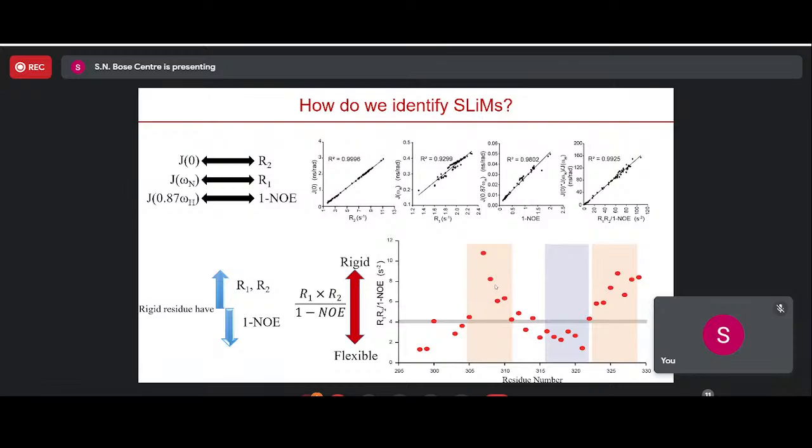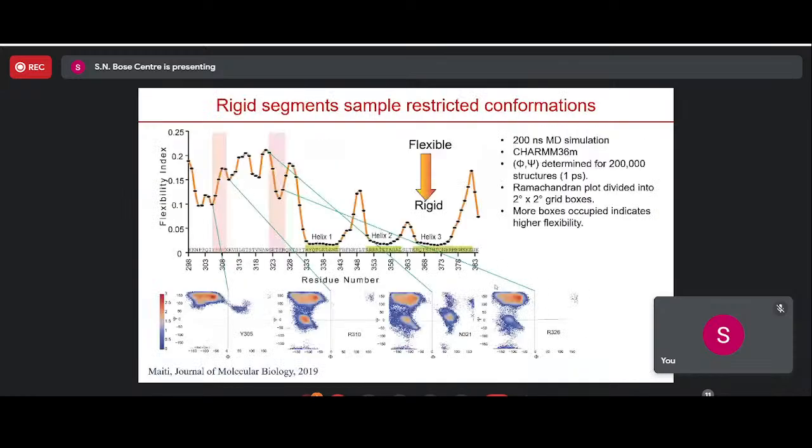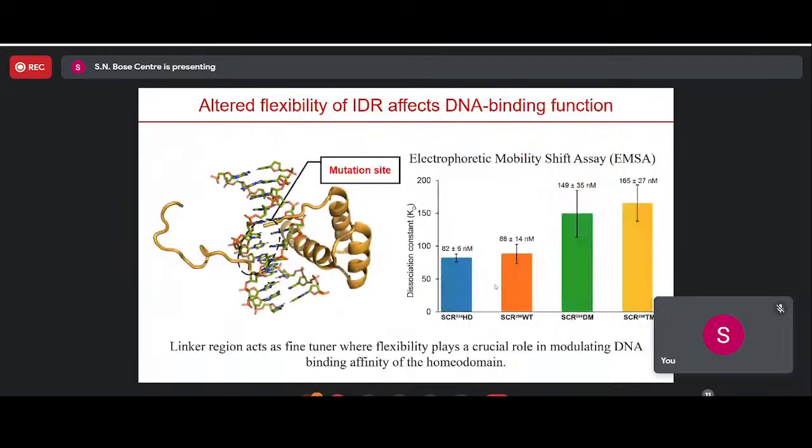Like some part of the protein is missing, the residues. Yes. So this is actually from a crystal structure, right? In a crystal structure, if something is highly flexible, then you don't get any electron density for those regions. That's why it shows up as missing. But when we are doing NMR, we can see everything, right? For NMR, it doesn't matter whether it is rigid or flexible. We can see it.